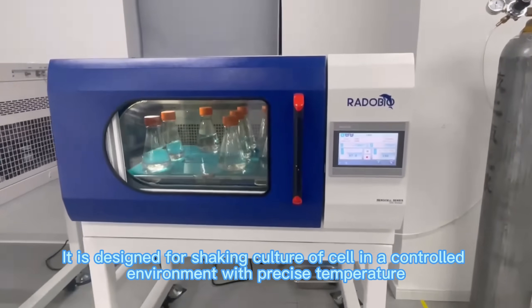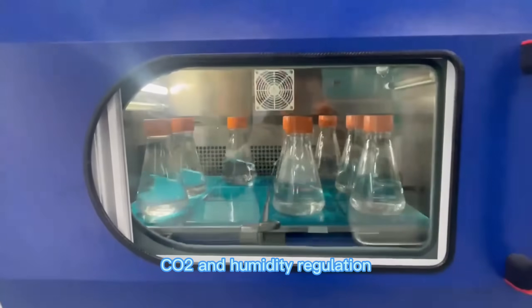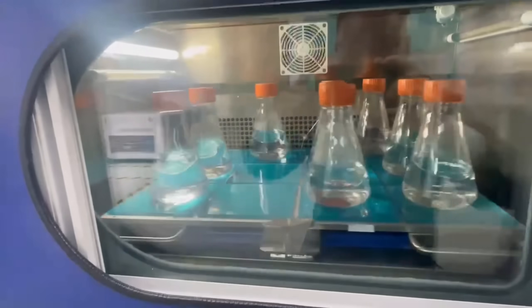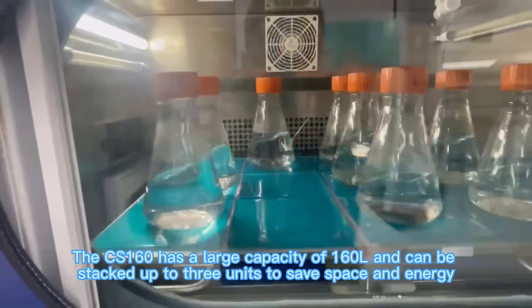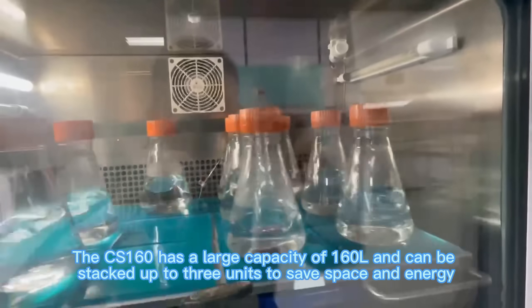It is designed for shaking culture of cells in a controlled environment with precise temperature, CO2, and humidity regulation. The CS160 has a large capacity of 160L and can be stacked up to 3 units to save space and energy.